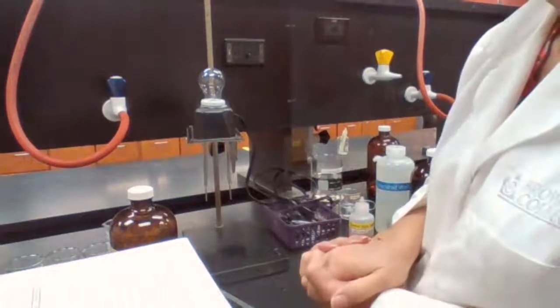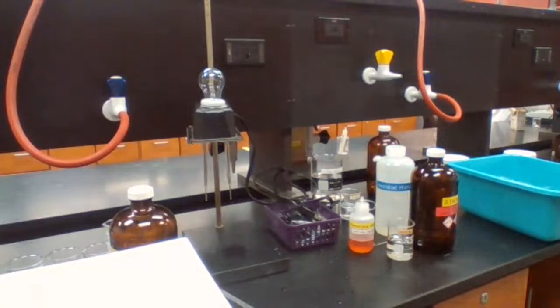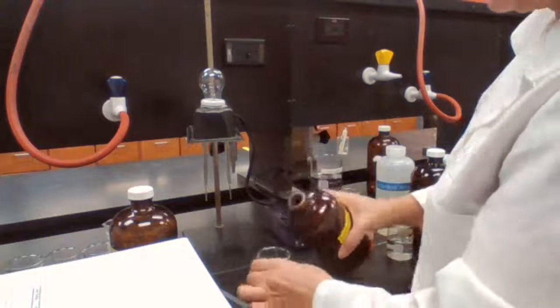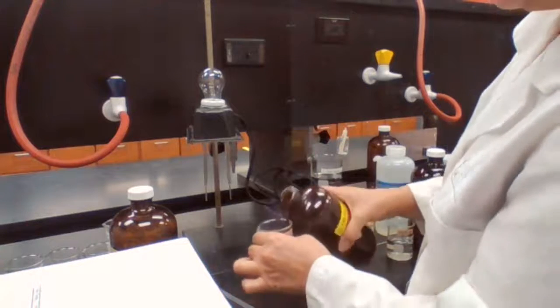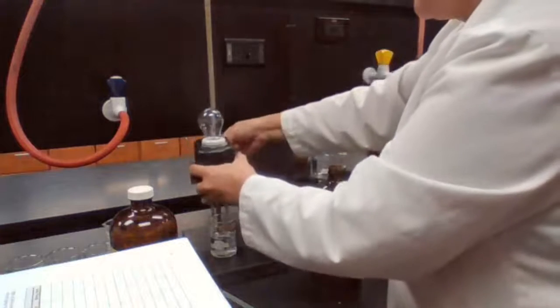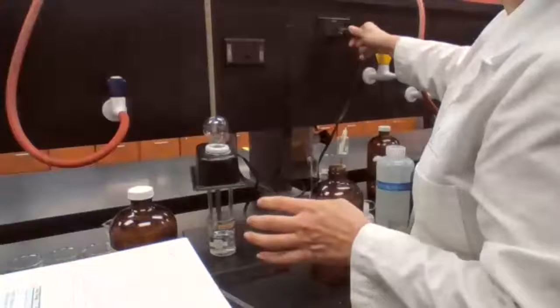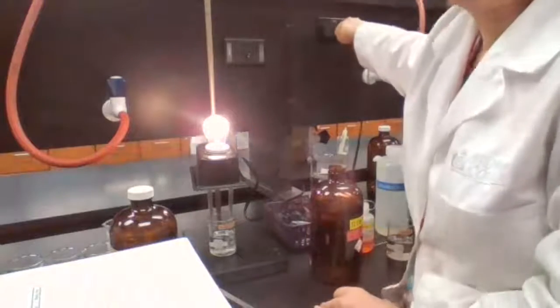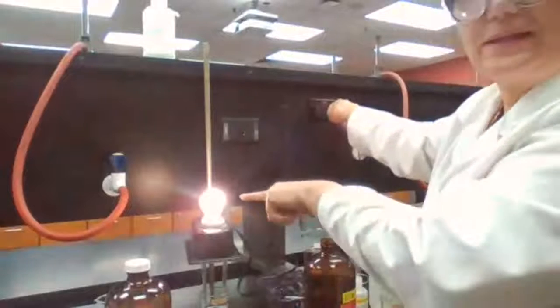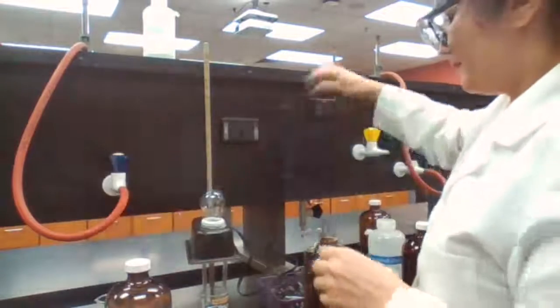Next, we have NaOH. For NaOH, sodium hydroxide is also a strong electrolyte because sodium hydroxide is a strong base. So if you have sodium hydroxide as a strong base, it's going to give us bright light, which means strong electrolyte.